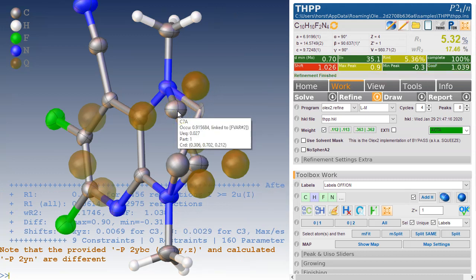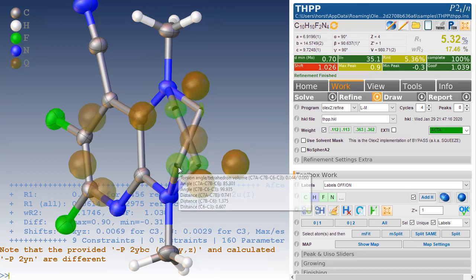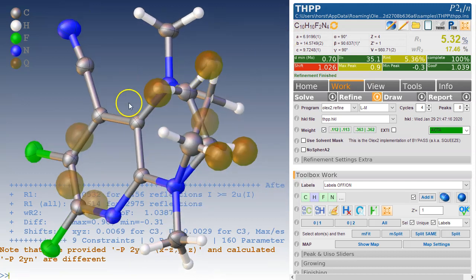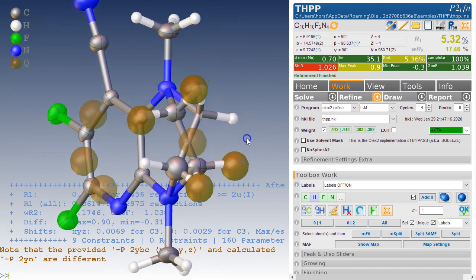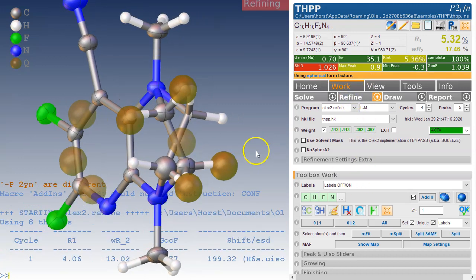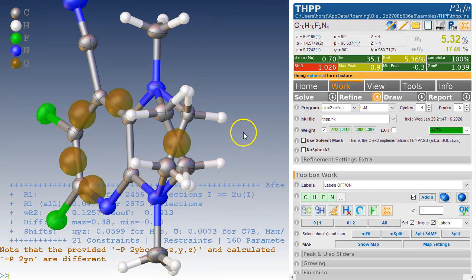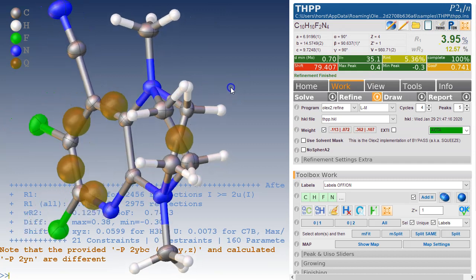So refine this again and this is not looking too badly. The free variable is about 90% and we can add the hydrogens to this. So we can try just selecting all of those and typing H add and it has done the right thing. It figured out that there are CH2s and all of those. If I refine this then let's see what happens. This gives a stable refinement and the R factor has dropped quite dramatically to 3.95%.